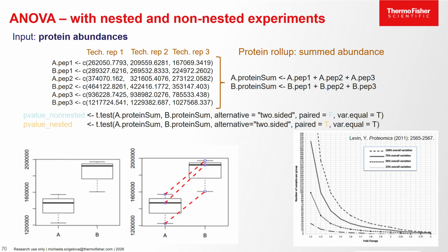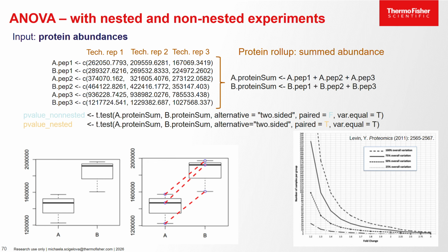It is because the label-free quantitation data are data with quite a high variation in it. And if you look at the little plot which I pulled out from Ishai Levin's publication on the bottom right of the screen, you can see that depending on the certain variation of your quantitation data you admit in your final result evaluation, you will have to have a certain number of replicas. And below that, it would not simply be possible to consider certain fold change significant.